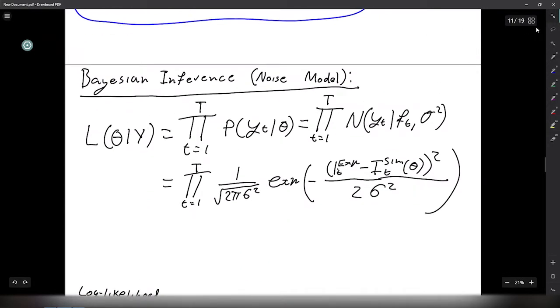Well, the likelihood of a parameter set given y is dependent on a noise model, where the most simple noise model is that of the total current difference squared, or the Bayesian total current difference squared, which is we assume that each point of your experimental data is normally distributed around the mean. So again, we go back to the mean, and we assume that there is a normal distribution of the data points like so.